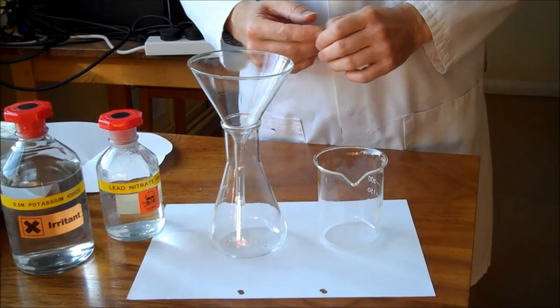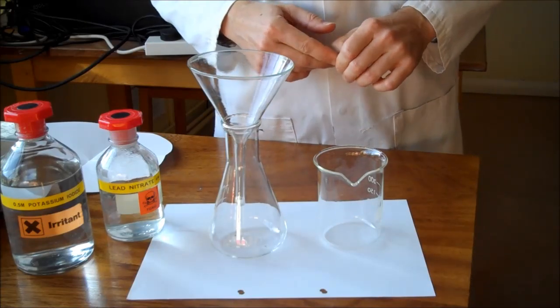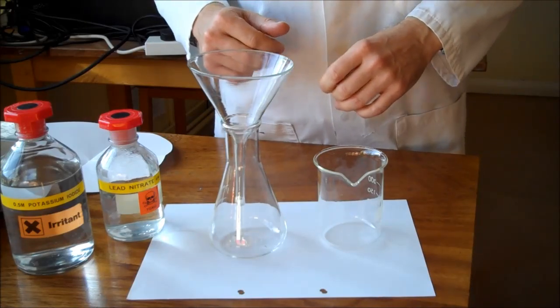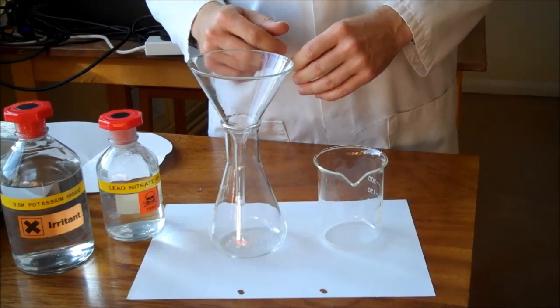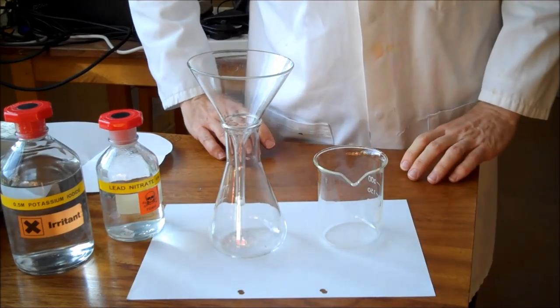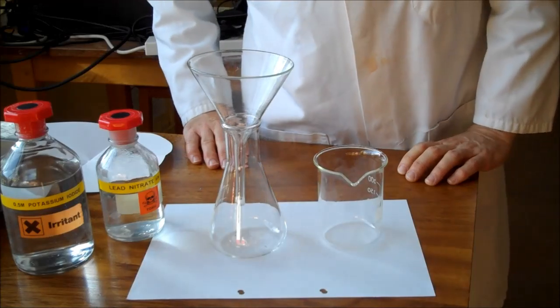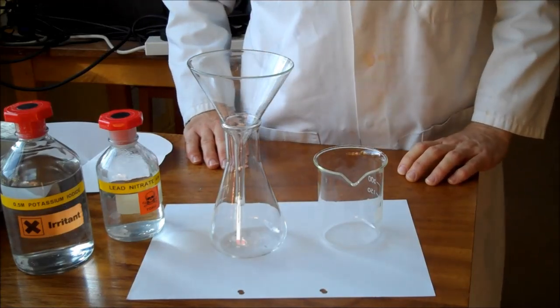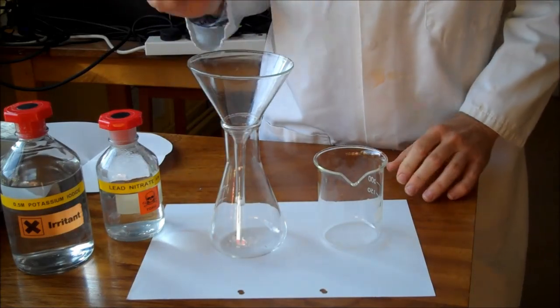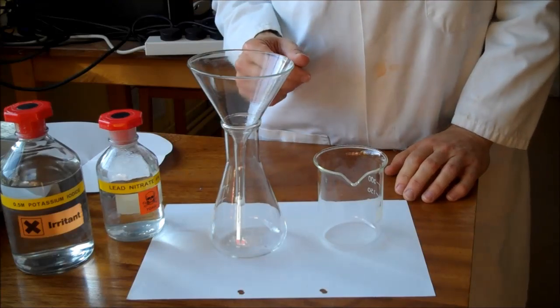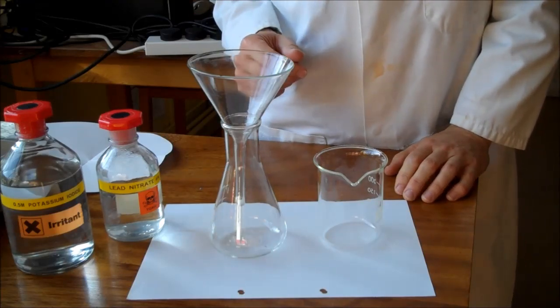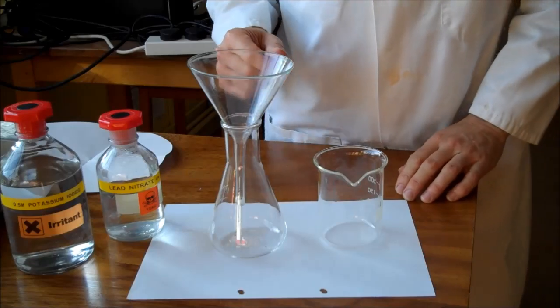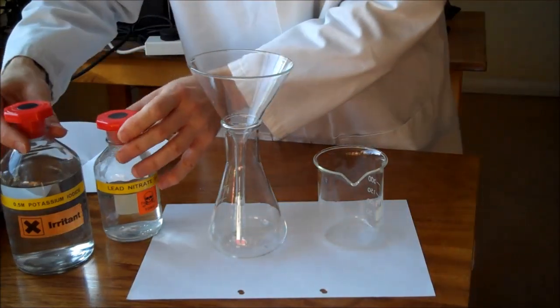In this video we're looking at making an insoluble salt by a process called precipitation. In everyday life precipitation means hail, snow, rain, sleet, drizzle, but in chemistry it's got a more precise meaning. It means when you make an insoluble solid from a solution or from two solutions.